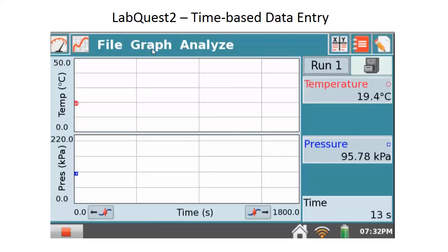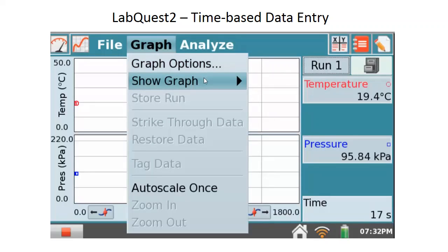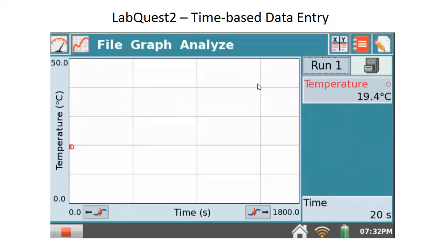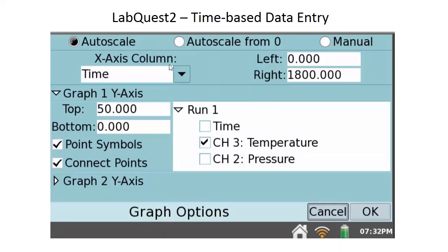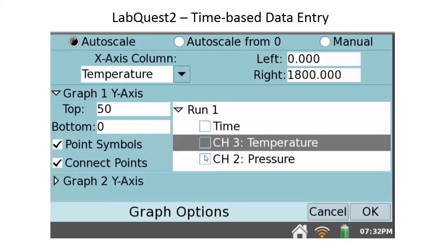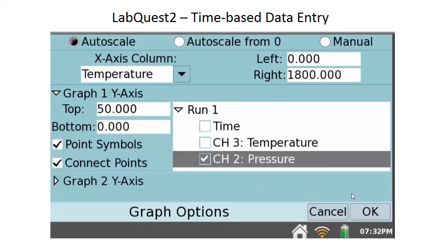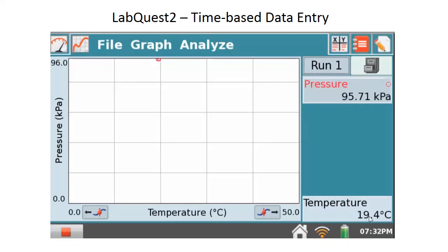So I'll get rid of one of these graphs. Go up to the graph option, click 'show graph 1.' Then go back into graph options and tell it: make the x-axis temperature and the y-axis pressure. Get rid of the temperature checkbox, click the pressure checkbox, and hit OK. There's my data developing. This particular setup I have here doesn't have sensors connected to anything real, so nothing's going to happen — but I'll show you data that lets you see how we manipulate it. As the run goes along, temperature will go up and pressure will likely go up as well, giving you a nice curve.